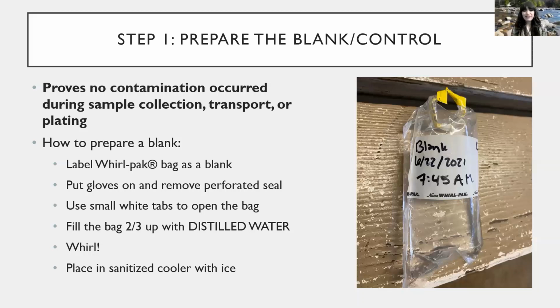Make sure that the bottle or the container of the distilled water doesn't touch the inside of the bag either. And then you're going to whirl it. Unfortunately, I don't have a Whirlpack with me tonight, but you'll just hold it by the yellow tabs. You can see it in the photo, and it's a whirling motion with your wrist. And that's how it seals it up. And then it's just kind of like a twist tie situation with the yellow tag ends. And that's how you seal up the bag.